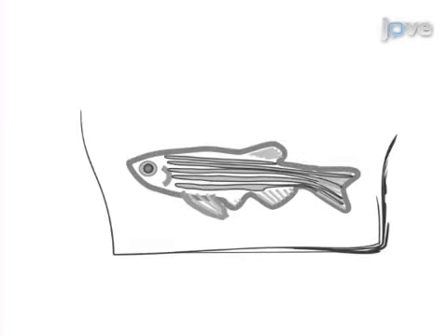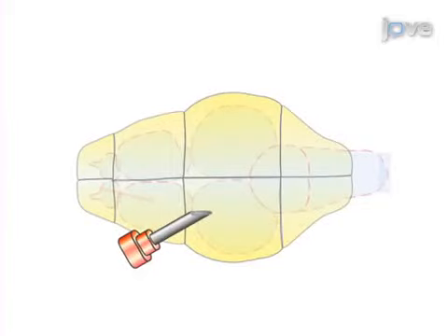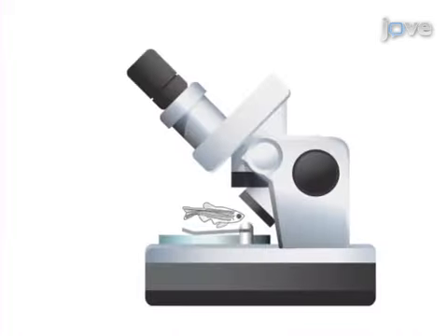This is accomplished by first anesthetizing the zebrafish. Next, a slit is generated in the skull overlaying the optic tectum using a barbed end needle. Then the morpholino solution is injected through the incision site into the cerebroventricular fluid. Finally, the injection efficiency and accuracy are checked under the fluorescence microscope.